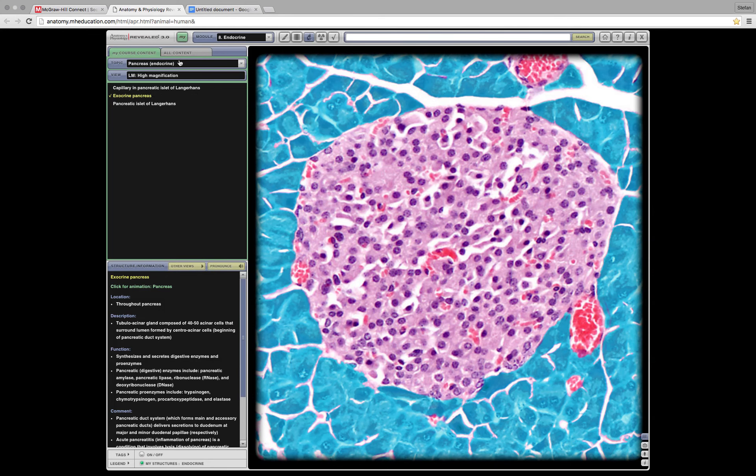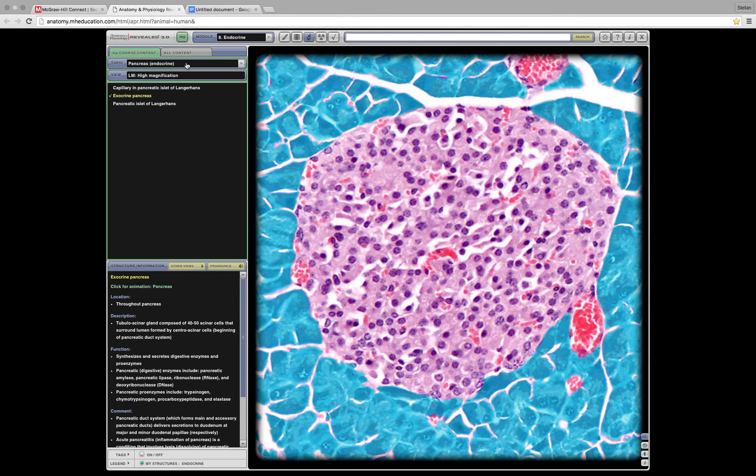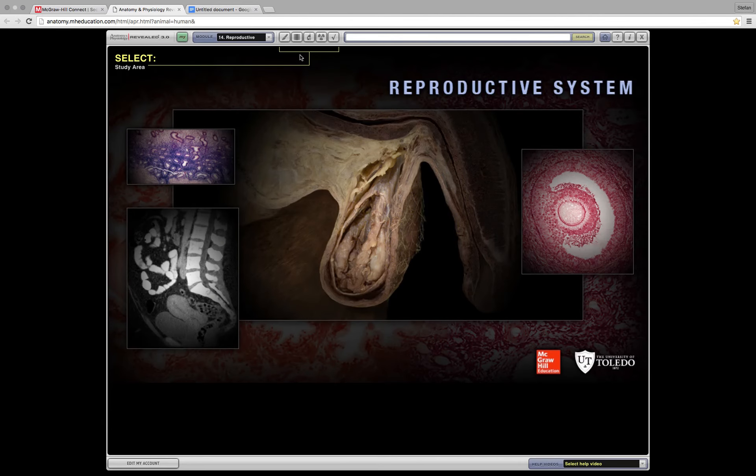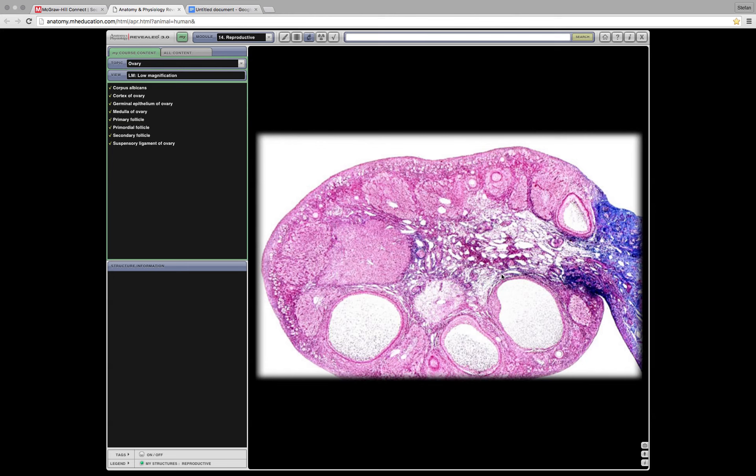Now let's look towards the ovaries. We have to switch chapters. Now let's go to the reproductive module. Click on the microscope, select topic ovaries. Here we go. That is an ovary. You need to know what the oocyte is. I'm not even sure what the oocyte is. So let's find this out.